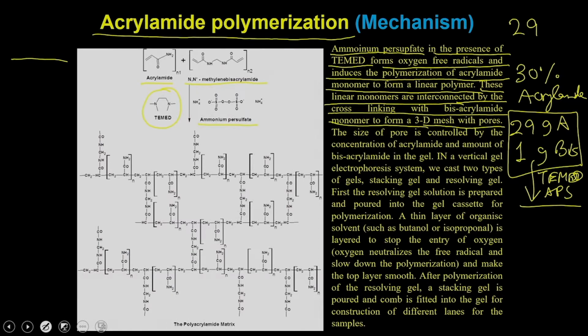So, they will form the fibers like this. Because these two molecules are forming the radicals, and suppose they form the radicals on one molecule, this radical is interacting with each other, and that is how they are making the polymeric fibers.